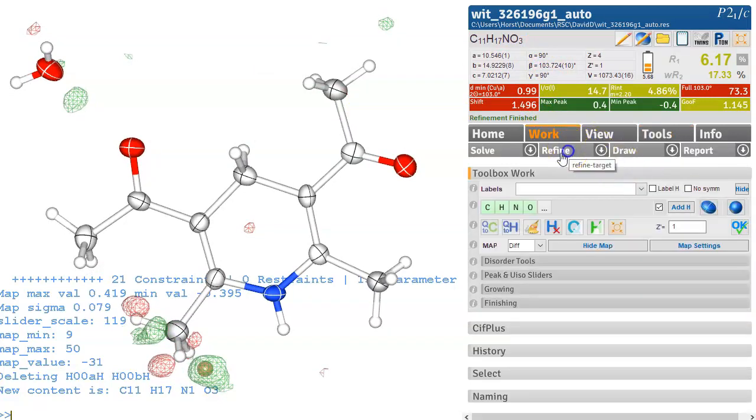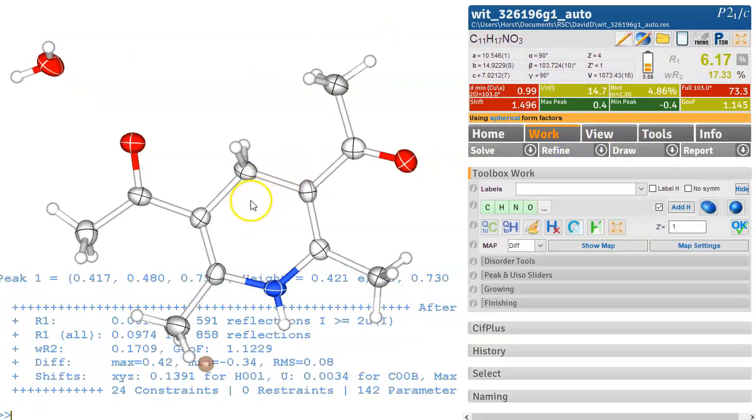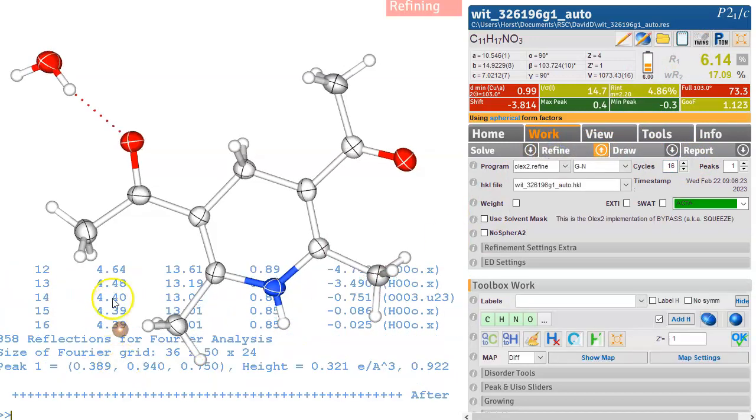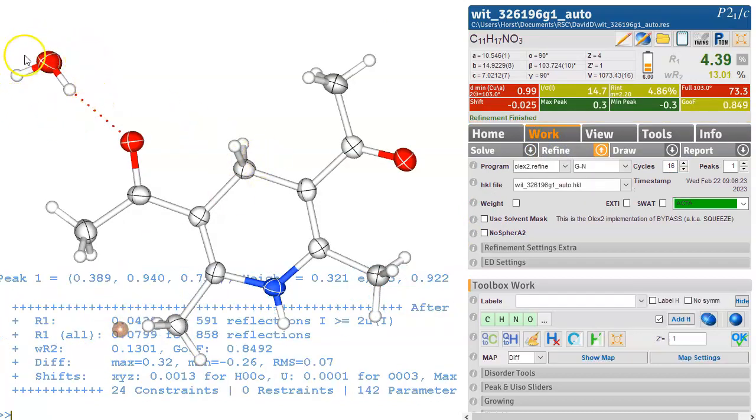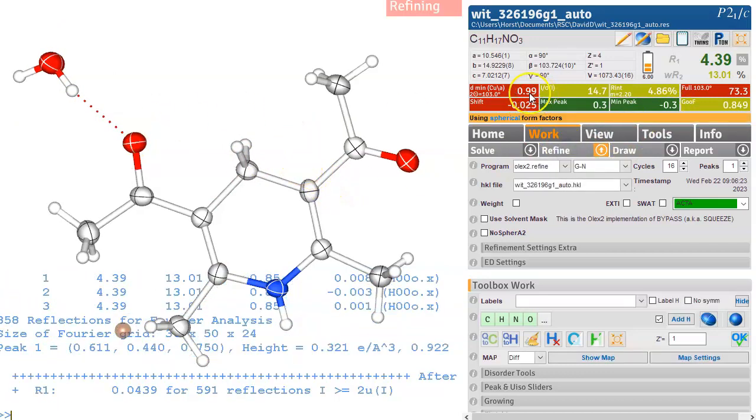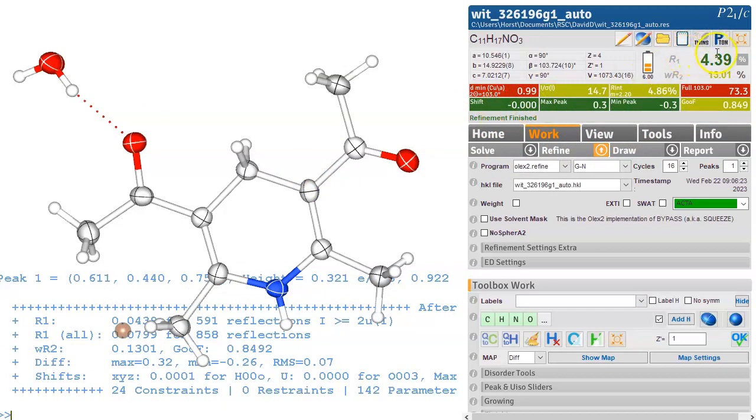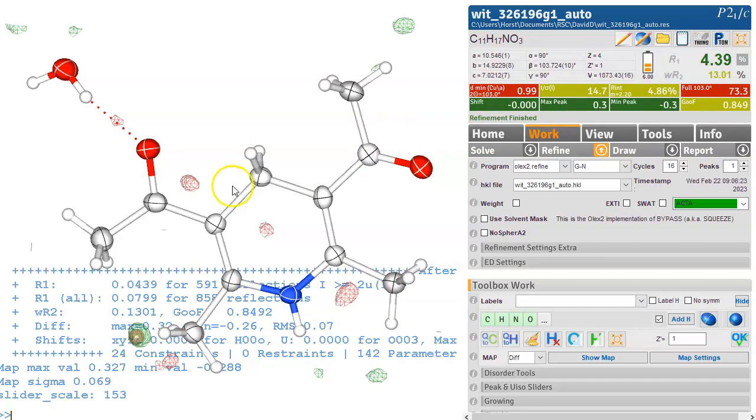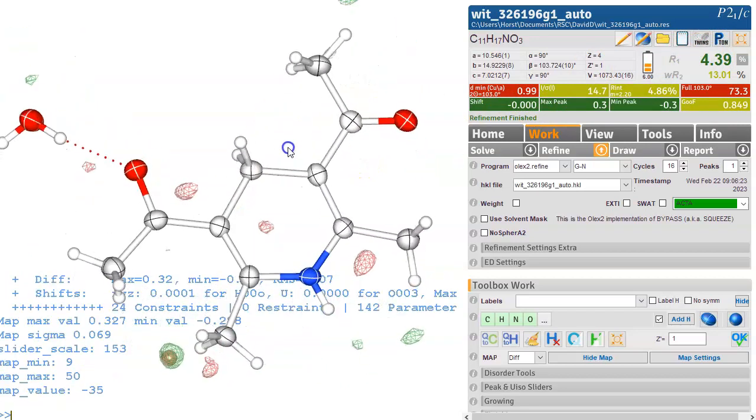Now we need to deal with some of these other things so let's just try some more refinement cycles. We get a lot more cycles here and refine this again. Olex2 refine will actually stop when things are settled so you might have noticed this water molecule rotated around to make the hydrogen bond here as you would expect and also the shift is now going towards zero 4.39% in R1.